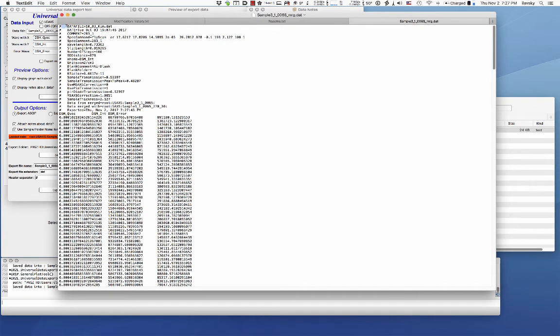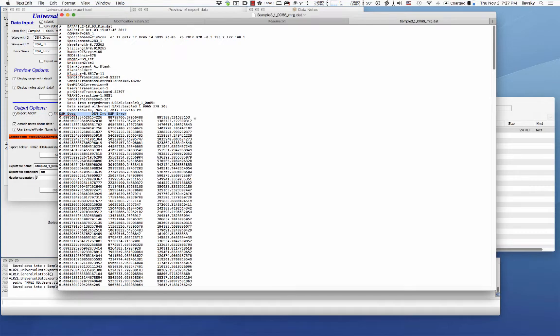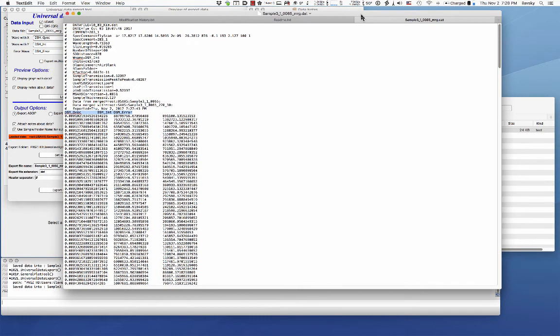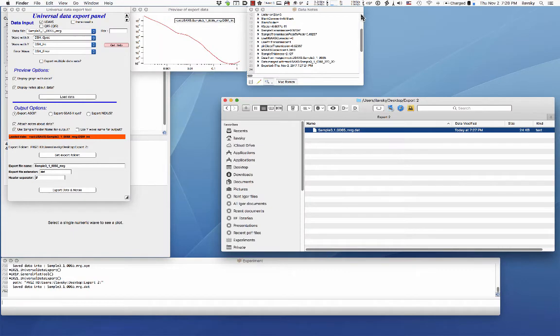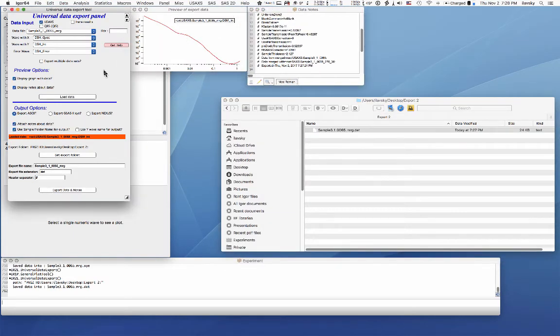And what you can see is that if you open it up in text editor, you see that you have a pound space and something. Then you have all the notes in here. Eventually that ends. There's a line with what the wave names were, and then you have three columns separated by tabs. So this is a very common format, which practically most software packages I know will find a way to read. So that's a very old format.